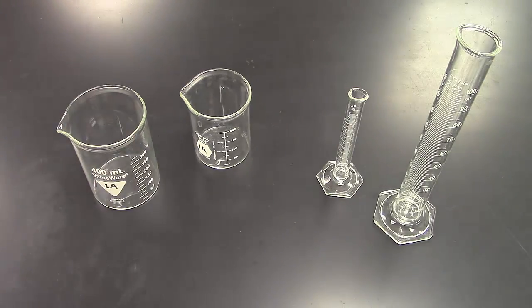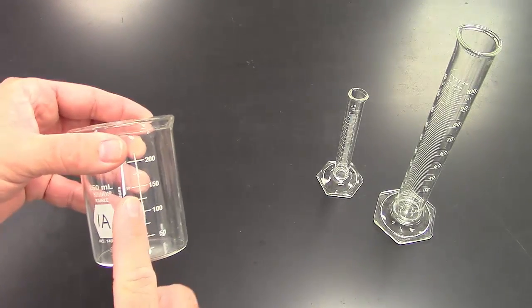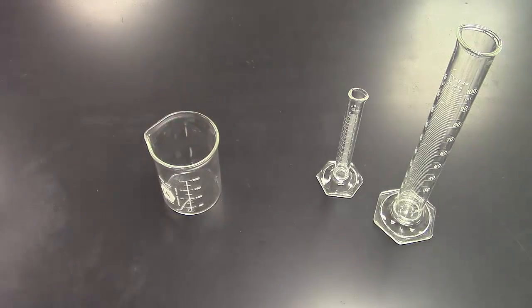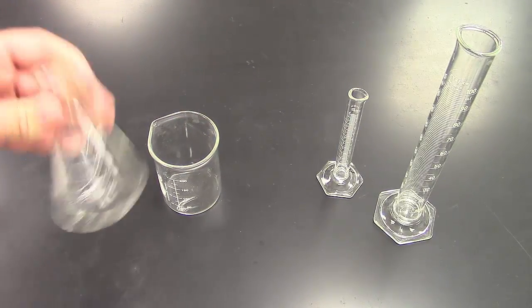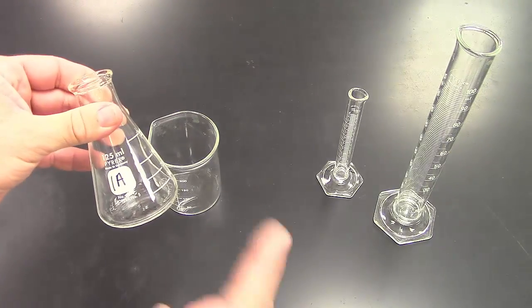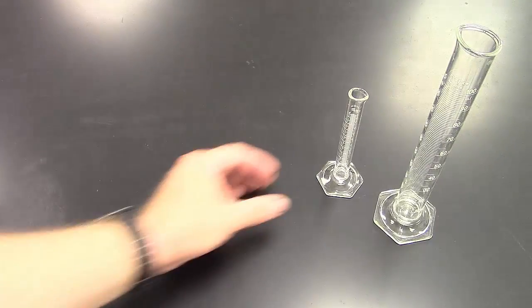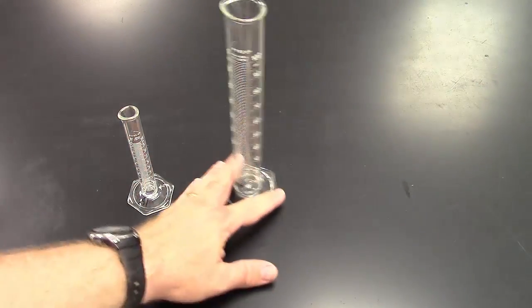That's just a disaster. So when you have to measure things, if you have to do an estimate, it's okay to use these, but this kind of glassware is really great for stirring. The Erlenmeyer is great for swishing, moving water or solutions, getting them to dissolve, but they're not really good for measuring. So if you need to measure a specific amount of water that you want to have reproducible results, be sure that you choose a graduated cylinder.